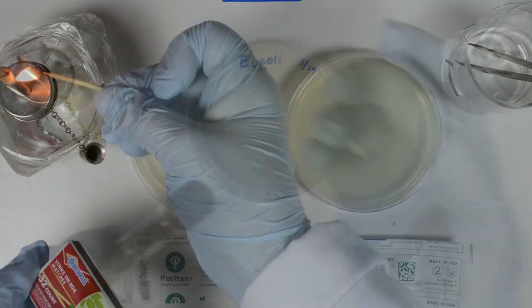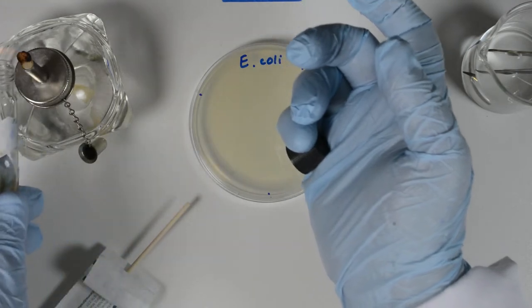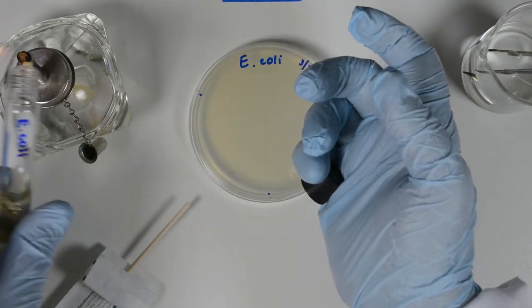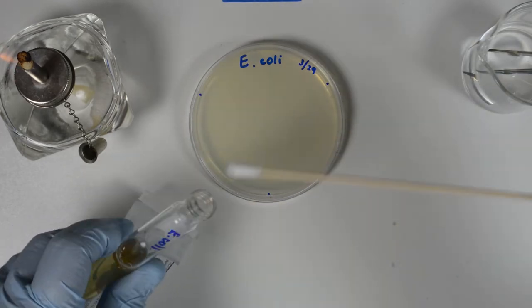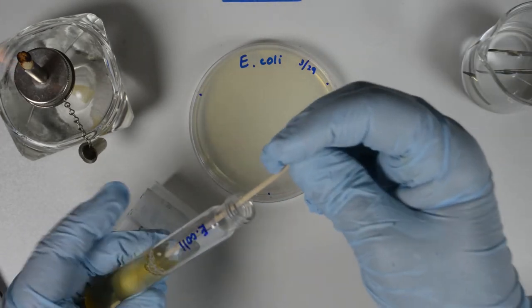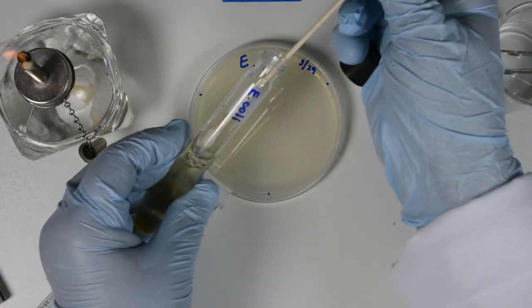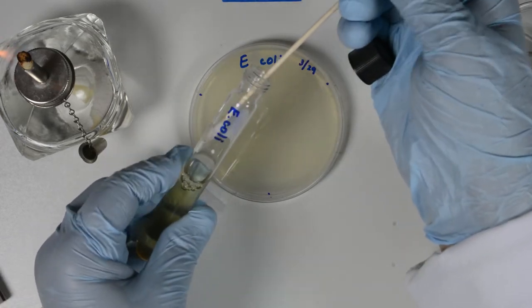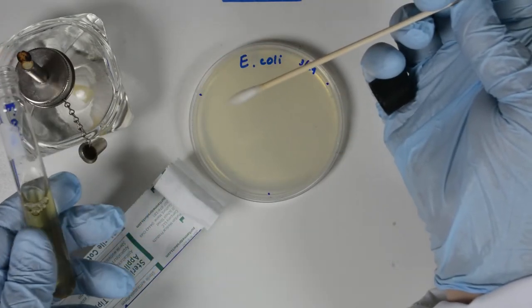Turn on the Bunsen burner. Now secure the culture tube in one hand, unscrew the cap, holding the cap with your pinky finger. We flame the mouth of the tube a few times to warm the glass, which will create some air currents that exit the tube, reducing contamination. Take the sterile cotton swab with the hand holding the cap and insert the cotton swab into the broth.